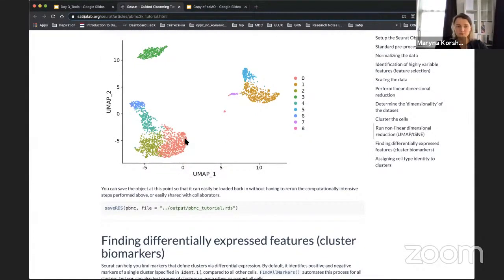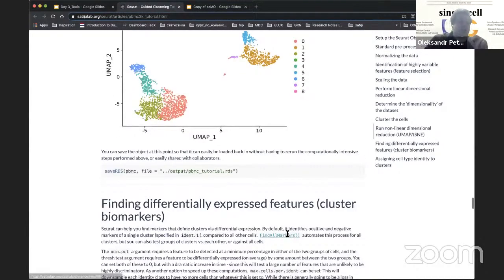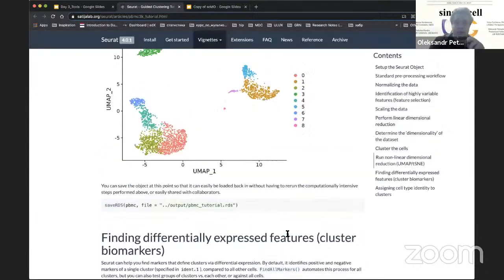Alexander, what do you do for cluster identification? Oh, that's one of my favorite points, because when you receive your precious data set after many weeks of establishing the protocol, and you see these numbers 1, 2, 3, 4, 5, you obviously want something more relevant for you, right? So there are a lot of different methods. So what I usually do.